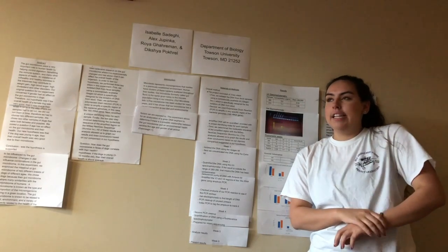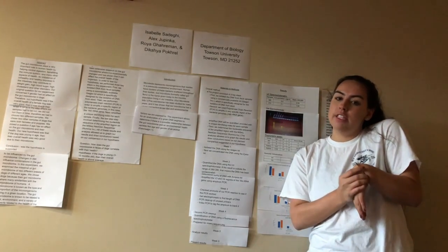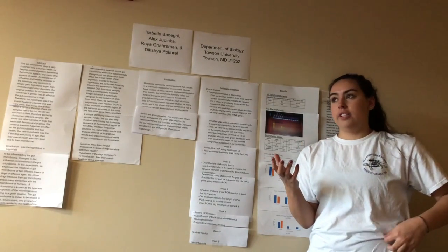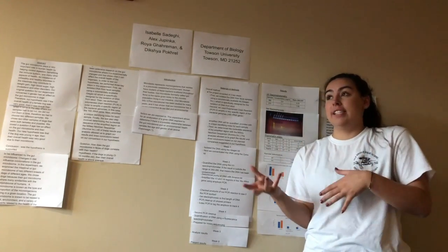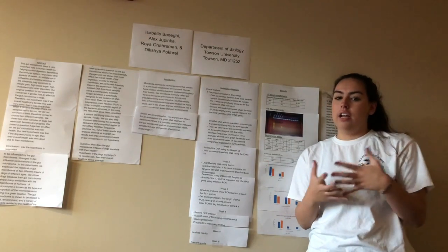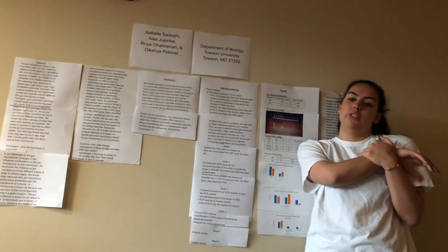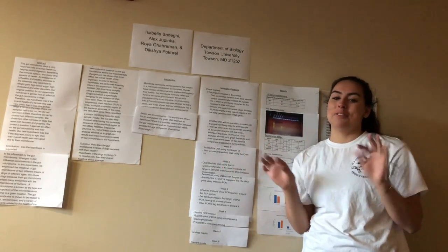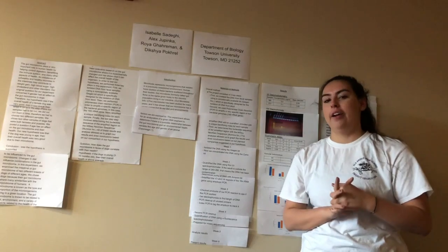Our data did not support this hypothesis because our results were skewed. Also, our samples that we tested didn't come back, so we had to use other samples. And in our original samples, our DNA concentration was too low to gather adequate results to support or deny our hypothesis.